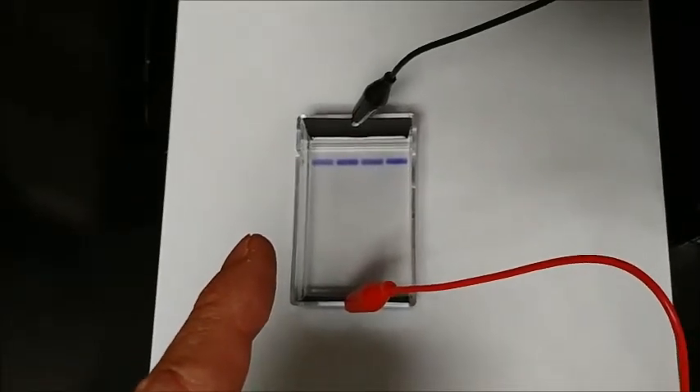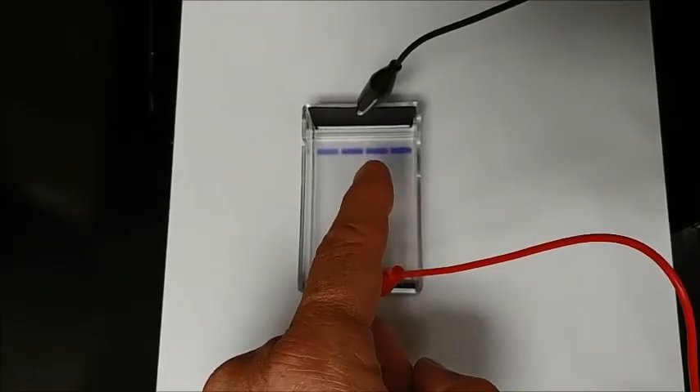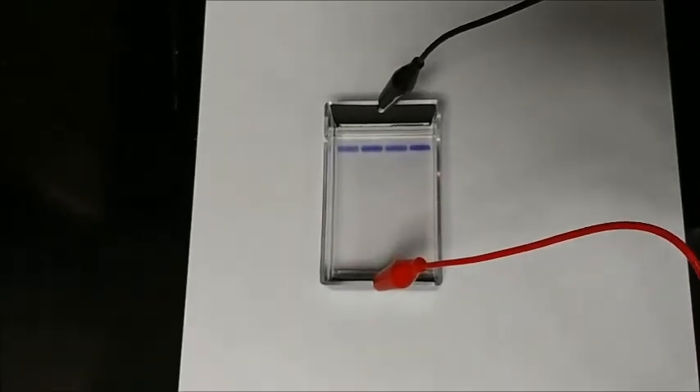In this forensics activity, we're running a mini gel electrophoresis. This is suspect one, suspect two. This is the victim, and this is the evidence. The evidence should be placed between suspect one and two, so we'll see how this turns out.